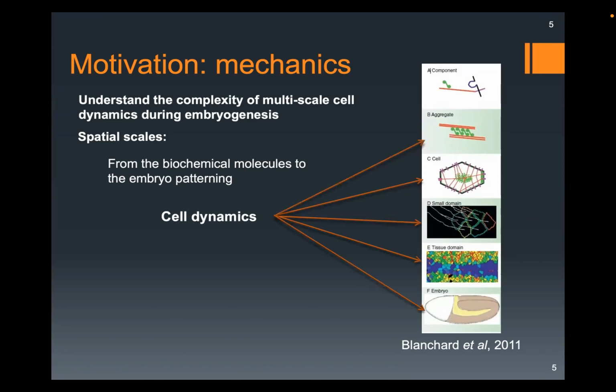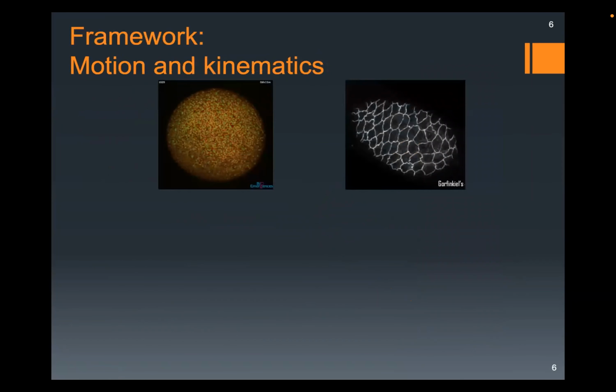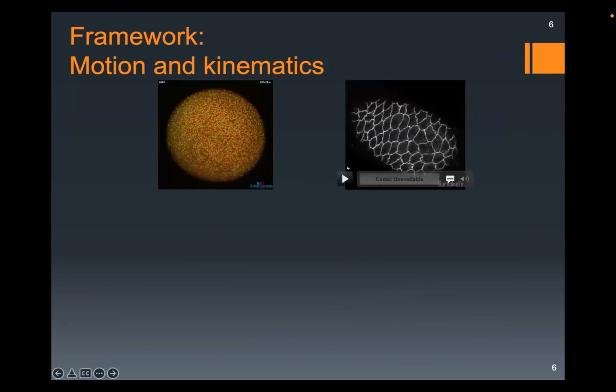And then it's how you go from the cell lineage to a multi-scale representation with different length scales, because we will be able to make an analysis of the different temporal scales, not only spatial, because spatial will go from the cell to the embryo, but also in time. And see here we have several movies of different embryos. We have here the embryo seen before, and here another different embryo, which is contracting the cells.